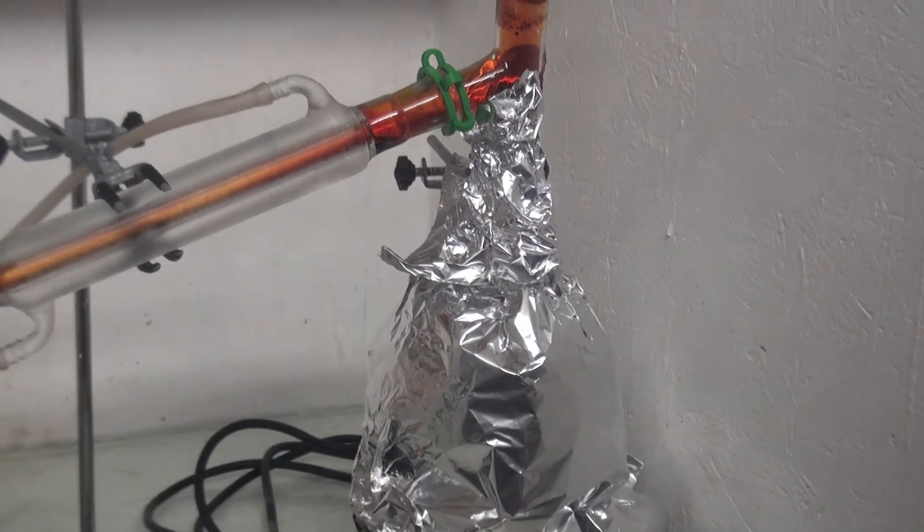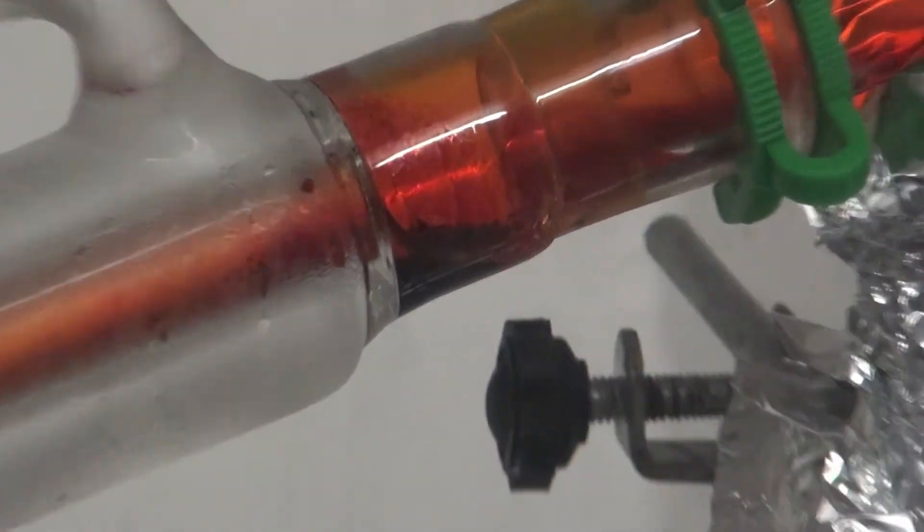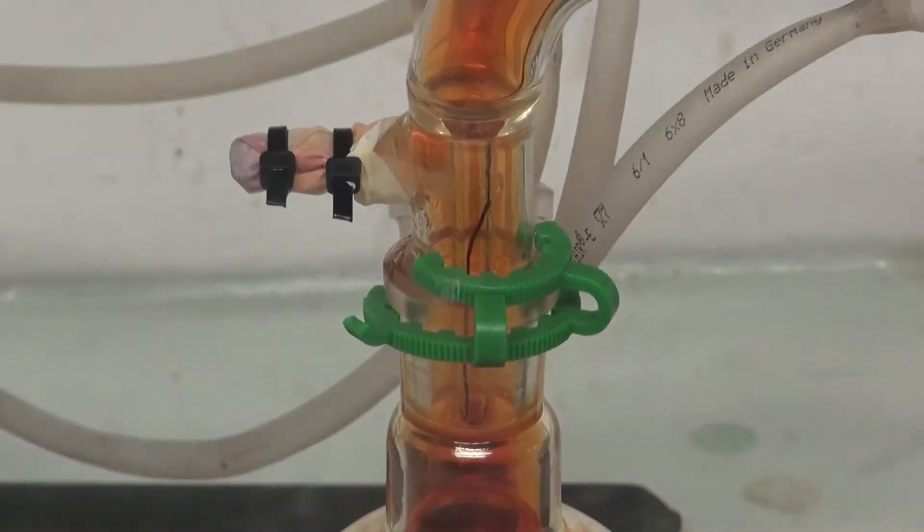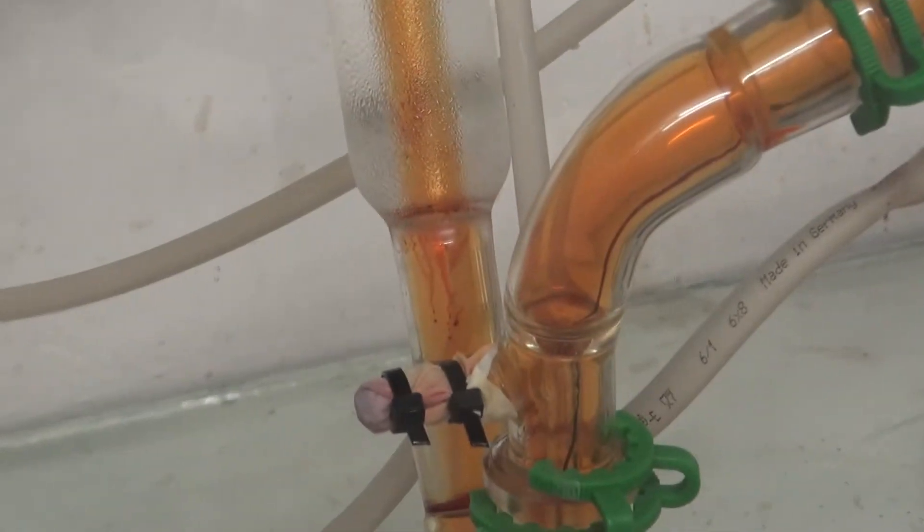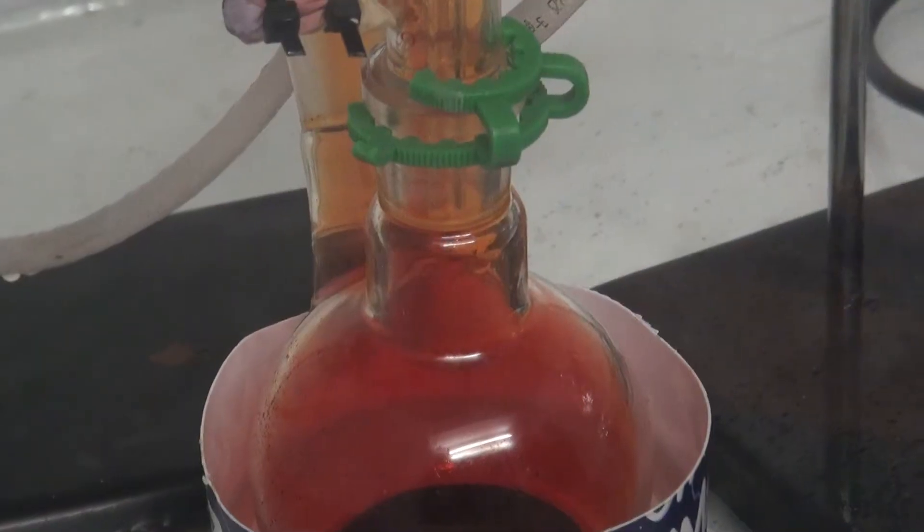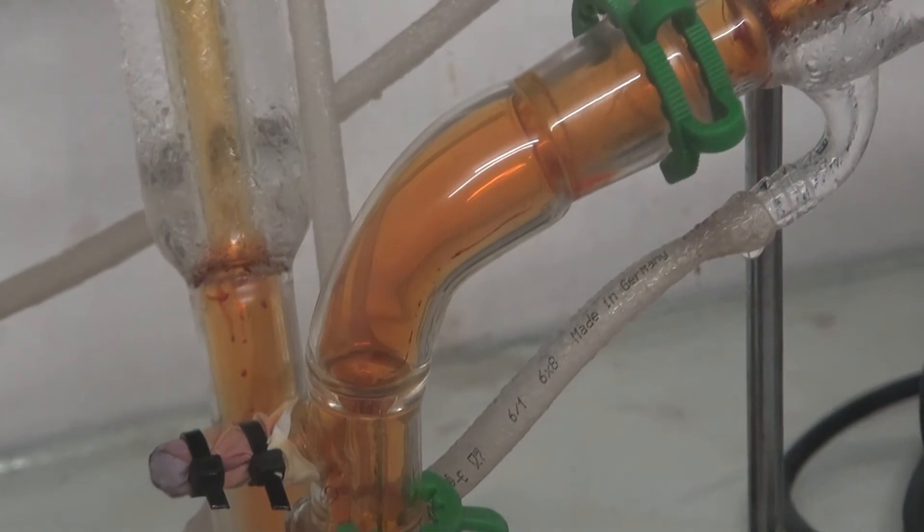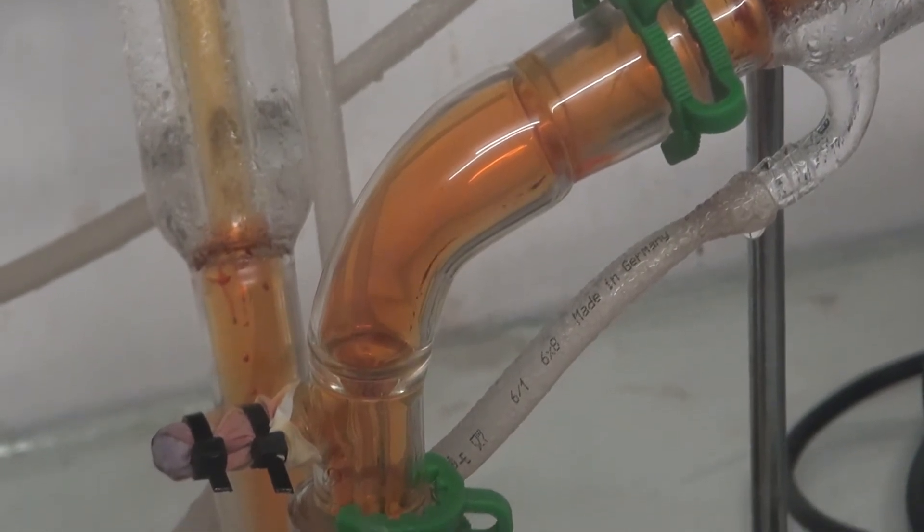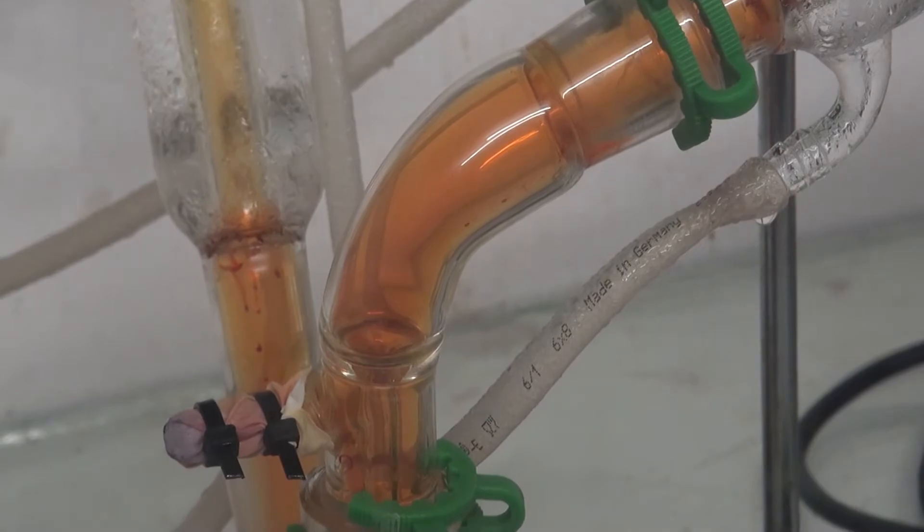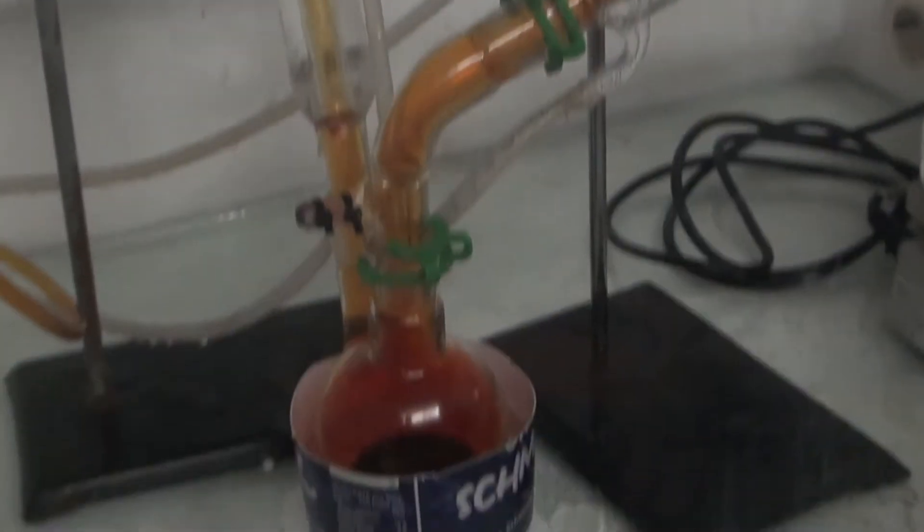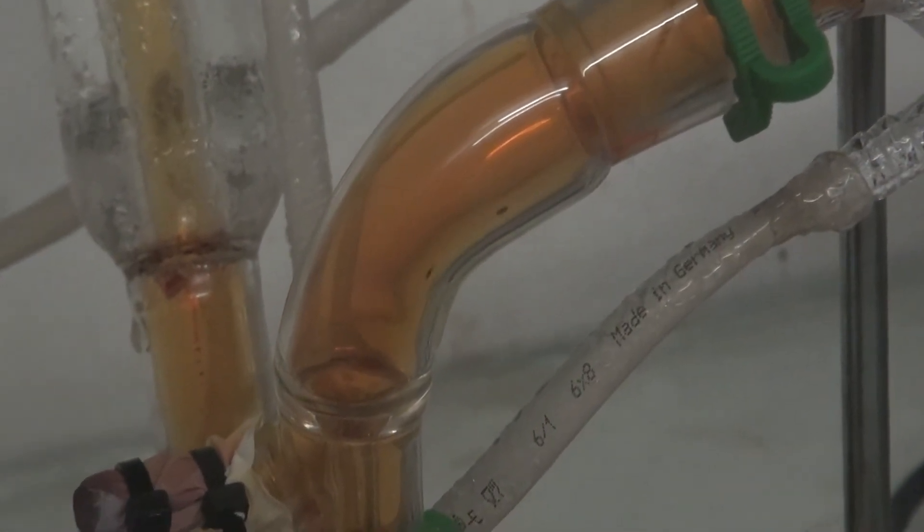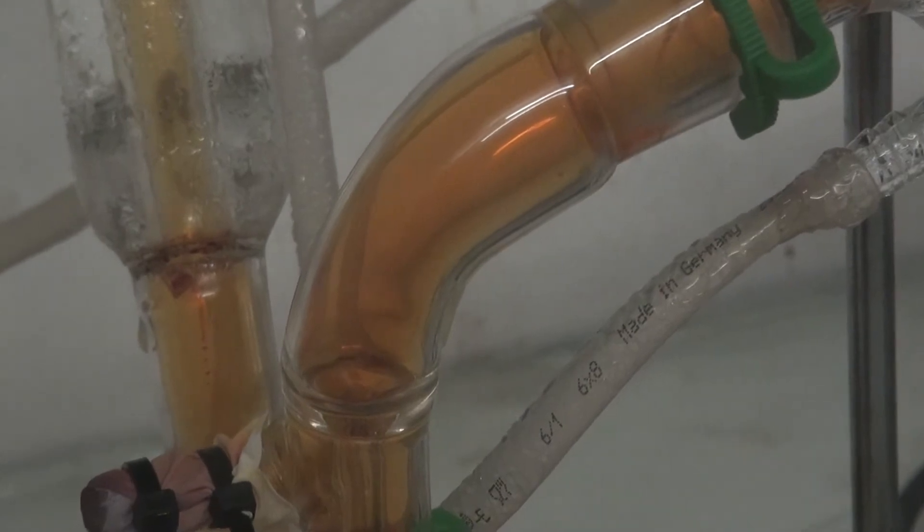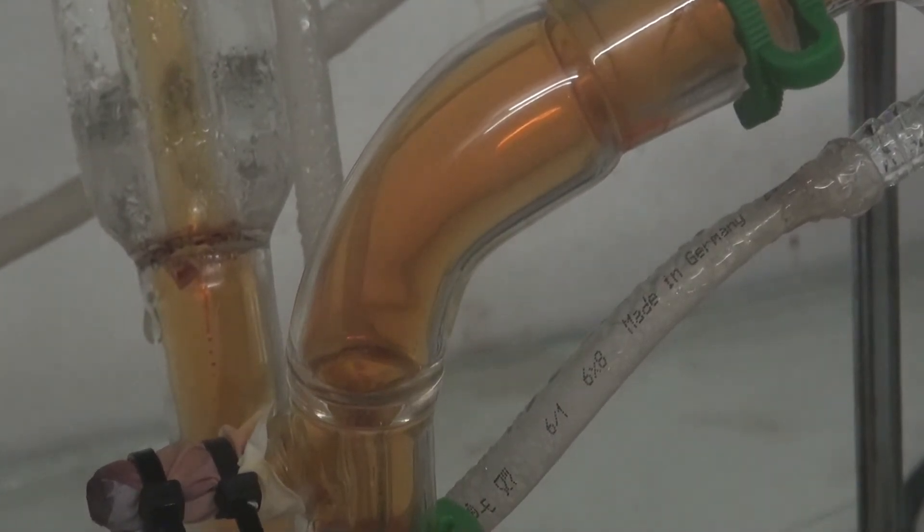The solution was heated and insulated with aluminum foil. After 3 hours no more bromine came over and the apparatus was disassembled.